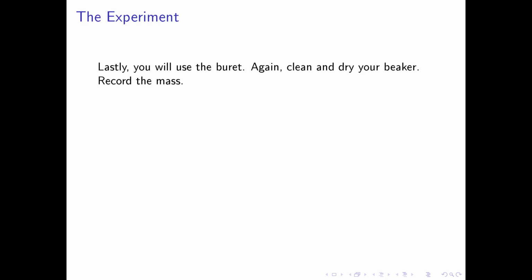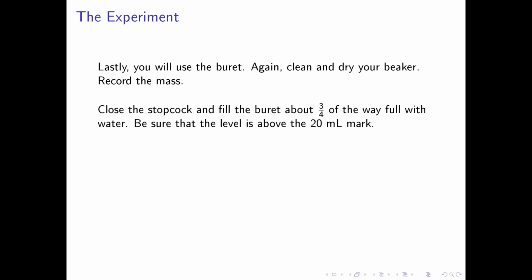Finally, you will use the burette. Once again, we start with a clean and dry beaker and record the mass. Close the stopcock on your burette and fill the burette about 3/4 of the way full with water. Make sure that the level of the water is above the 20 milliliter mark, or else you will not have enough water to complete the experiment.